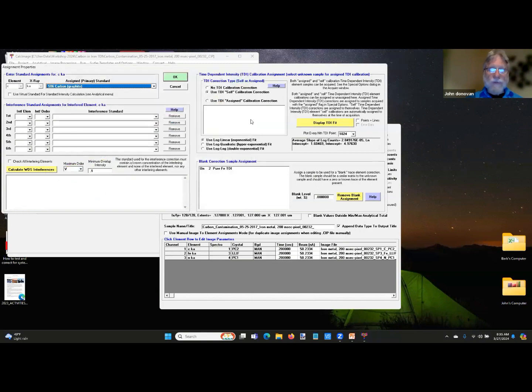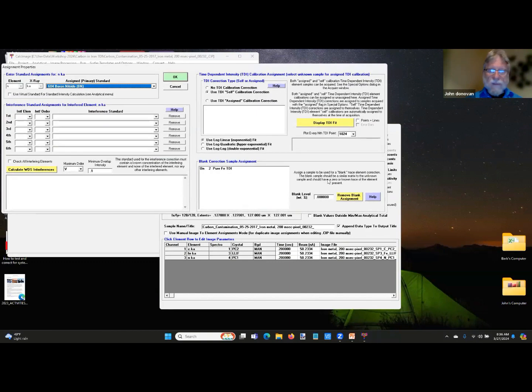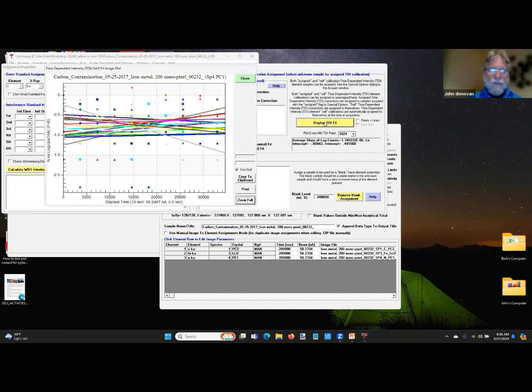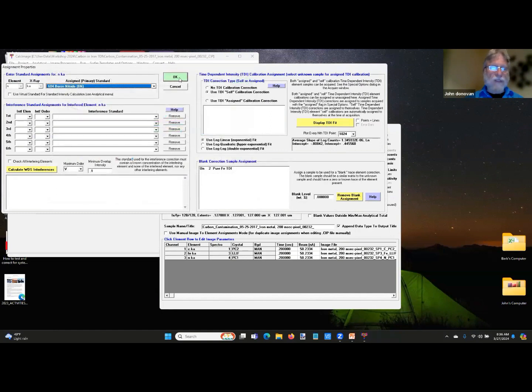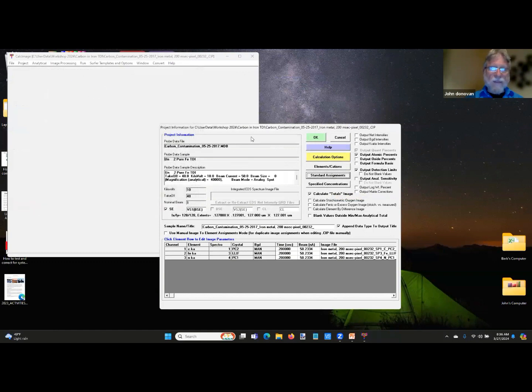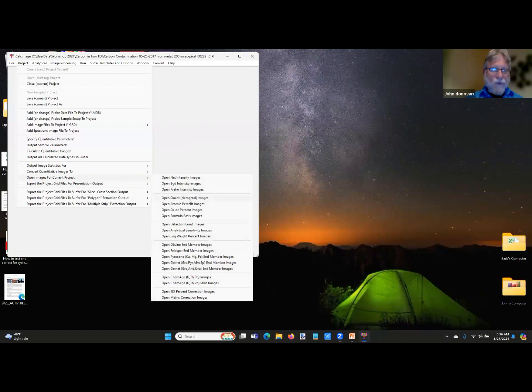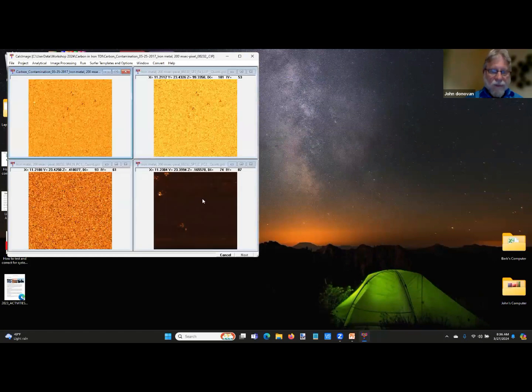And we can do the same thing looking at nitrogen. I can't even remember what nitrogen does. It's basically statistics, and that's looking at every 1024th pixel, just because it would be a lot of pixels otherwise. Okay, and now let's go ahead and look at the data. We'll open up the images for the quant, and now you can see we are getting essentially fully corrected for carbon here.